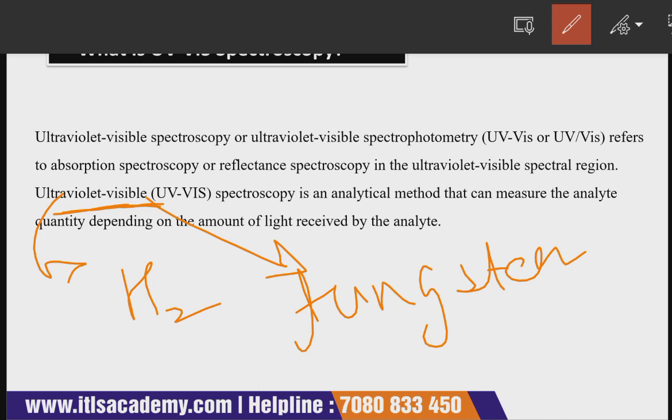There are several models of spectrophotometer which have varying degrees of sophistication. The sophisticated type of colorimeter is known as a spectrophotometer. What do you understand by this? Spectro means monochromatic light, the production by light sources of a whole range of continuous wavelengths. In this spectrophotometer the monochromatic light is passed through a prism, and this whole technique is based on a law known as the Lambert-Beer law.